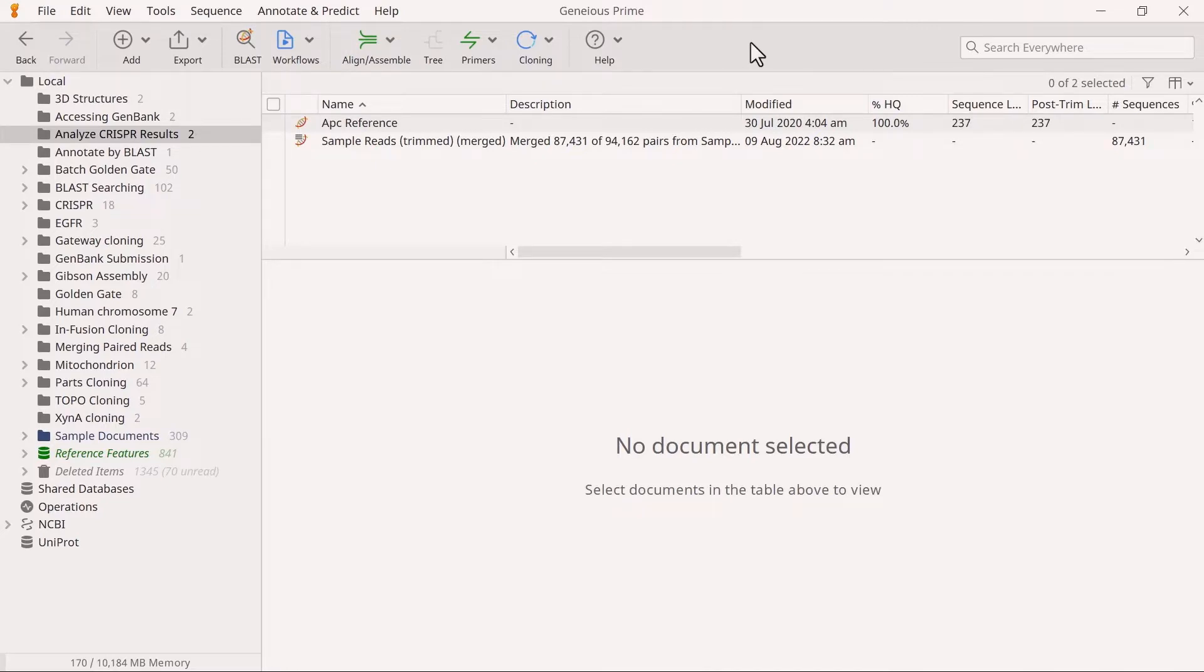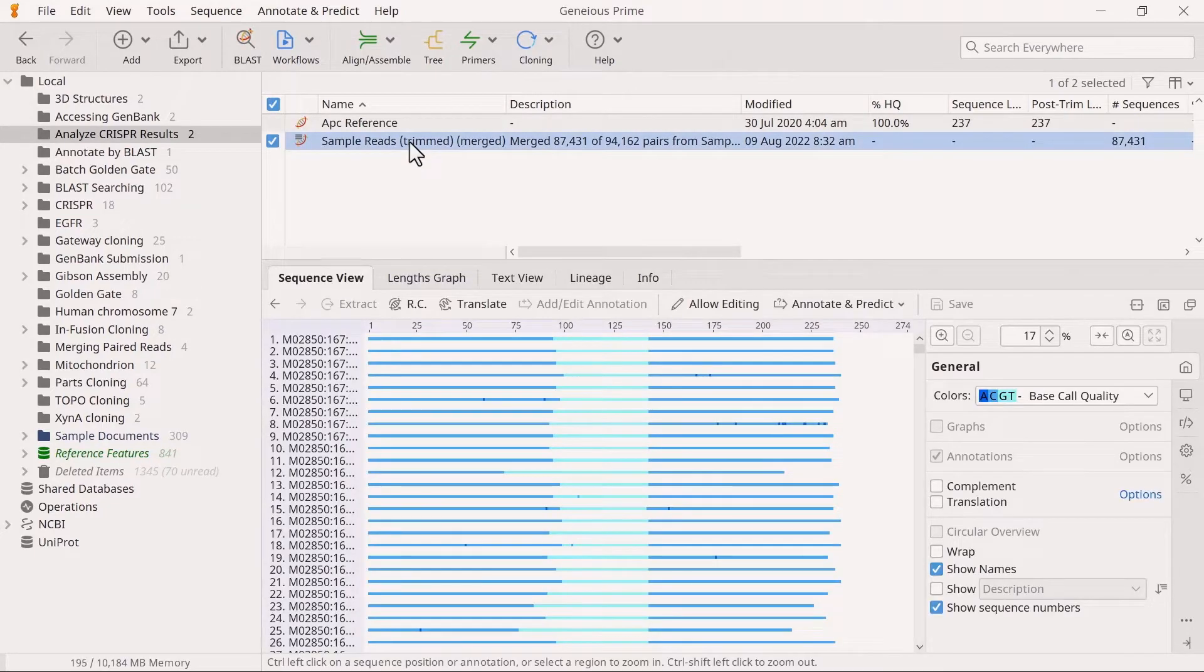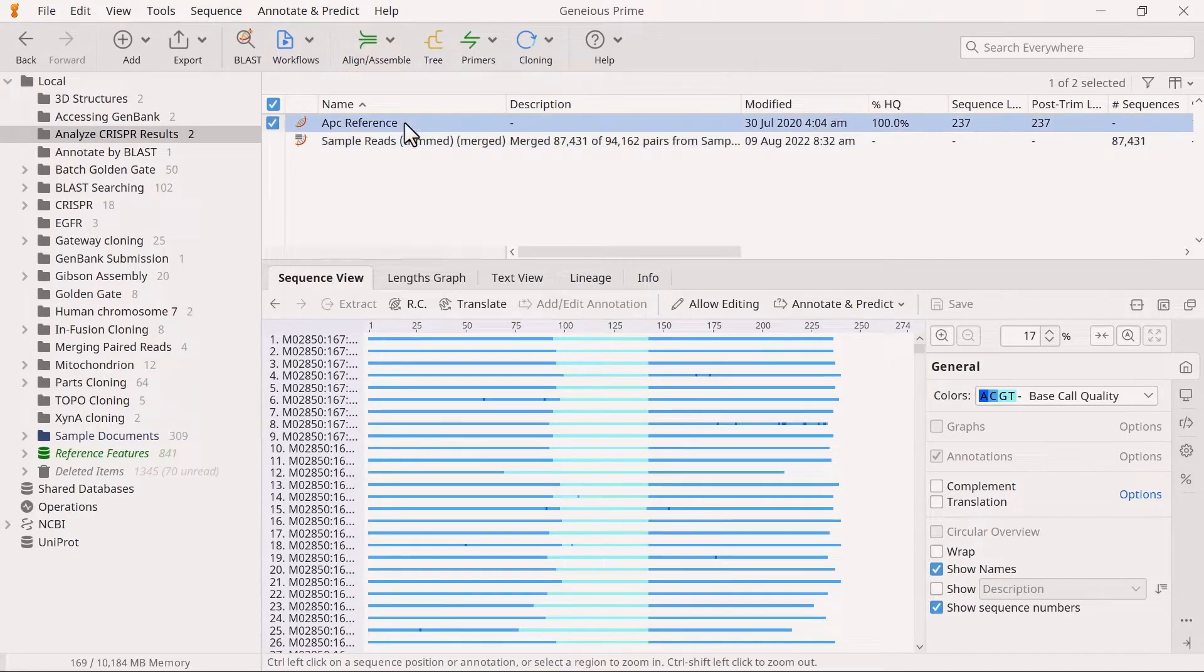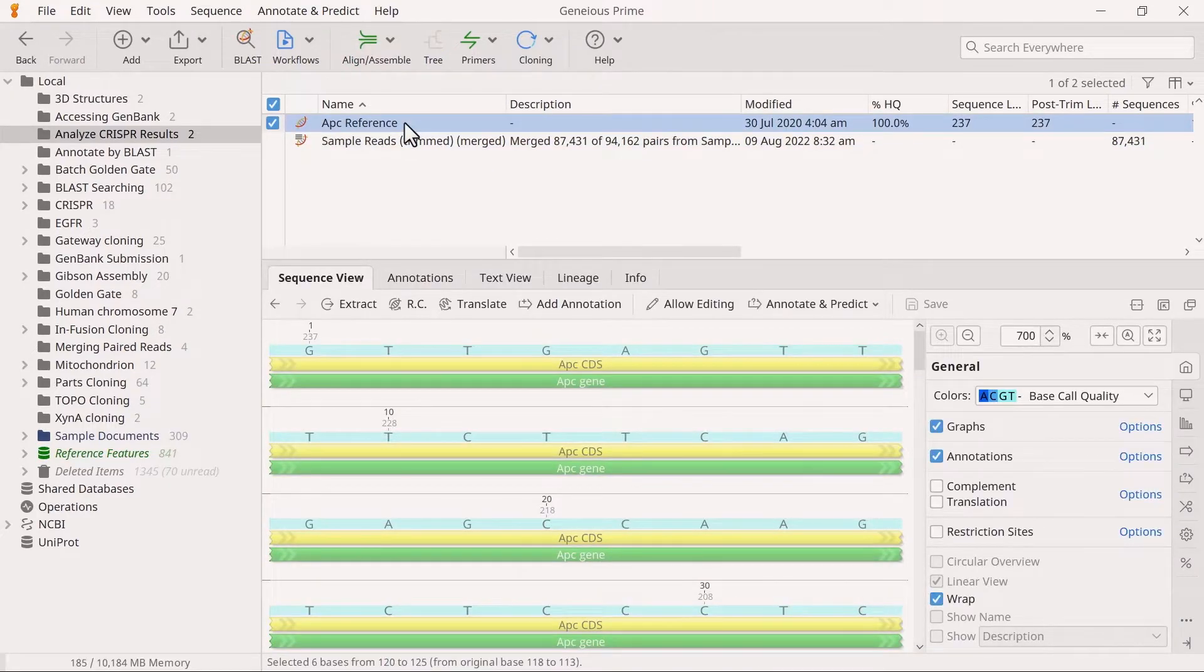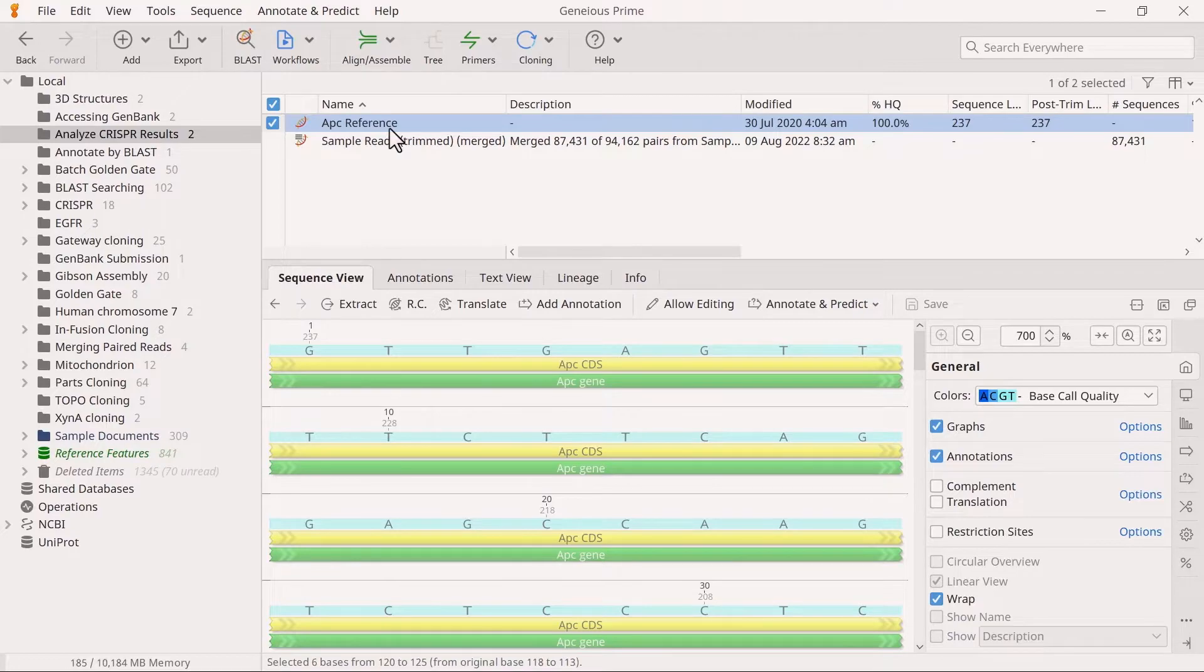I will use a file containing merged paired reads for this video. You will also require a reference sequence file to run the Analyze CRISPR editing results tool. The reference sequence should be a short sequence spanning the CRISPR editing site of similar length to the reads, typically the unedited amplicon sequence.